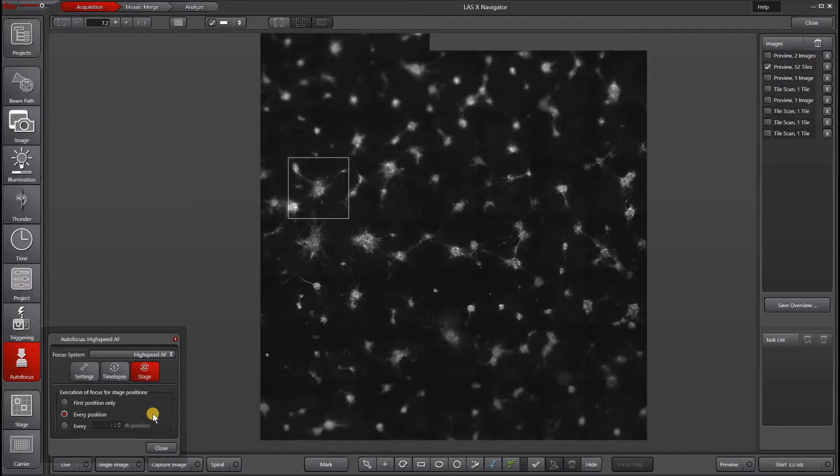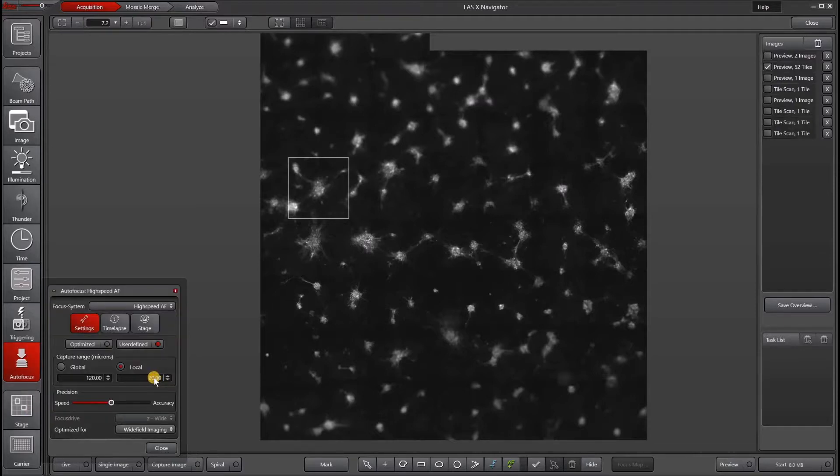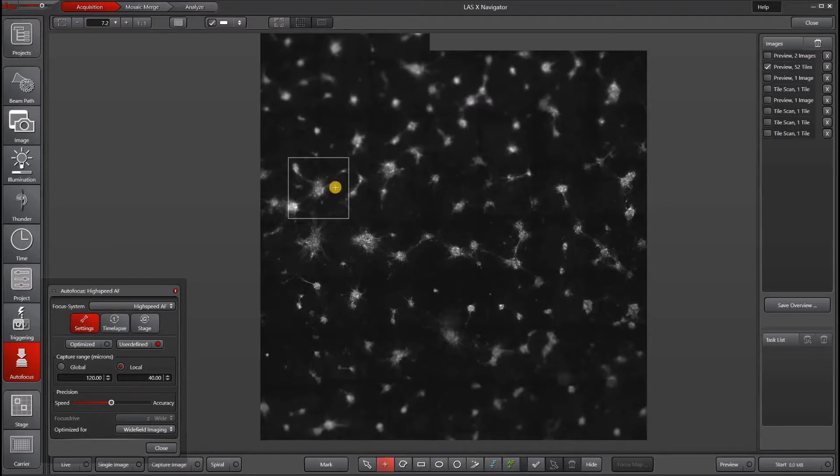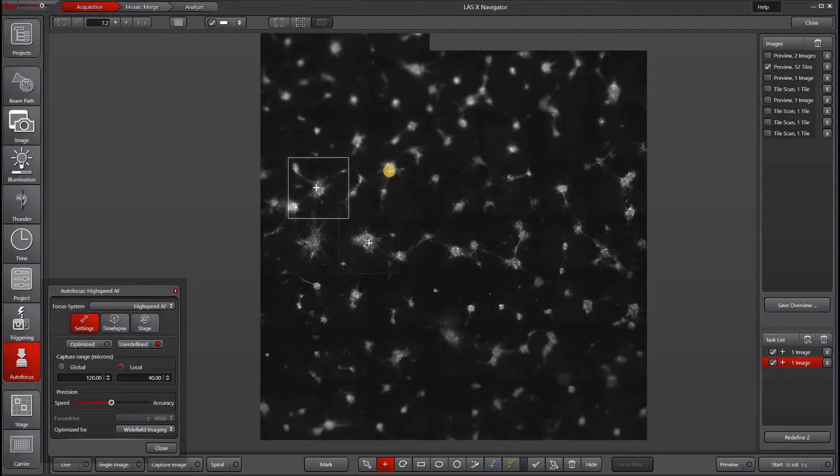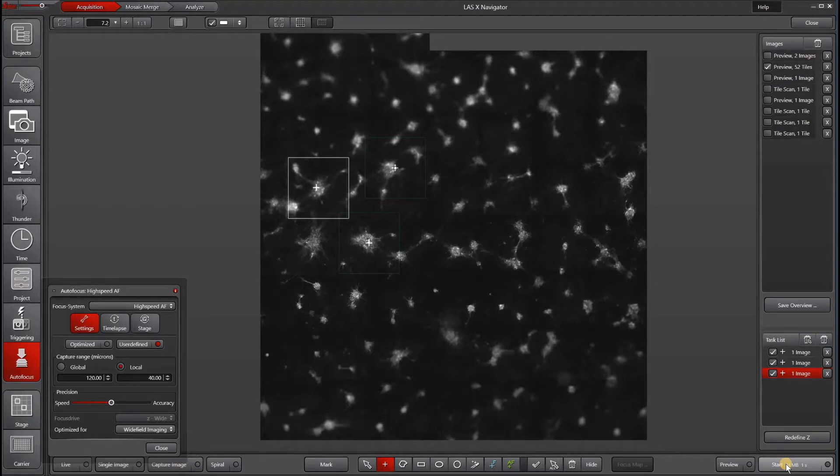So let's go ahead and just based on our settings, actually, I'm going to increase this to about 40 microns to get a bigger range. And then I will randomly pick three areas. I'm going to put them close together just to make it easier. And then I will go ahead and hit start.